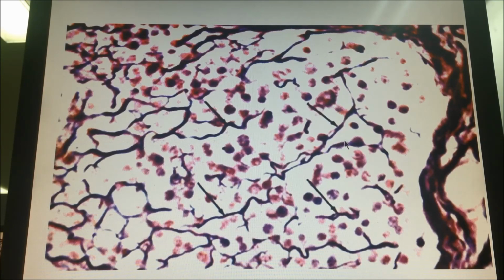In the fiber you see some dilatation, in certain areas that are darker. This is the cell that synthesizes the fiber. Who synthesizes it? Fibroblasts. The reticular fibers are a modified type of collagen, right? Didn't you take that in the theory? What collagen type? Collagen type 3. Reticular is collagen type 3. The cell that makes it must be the fibroblasts.